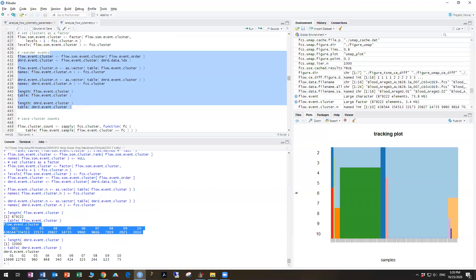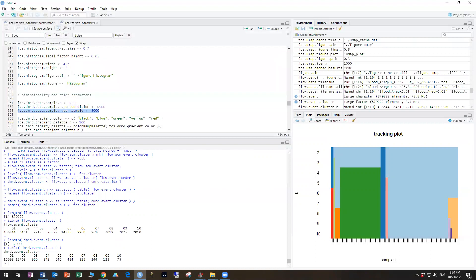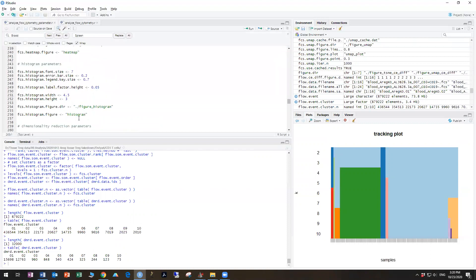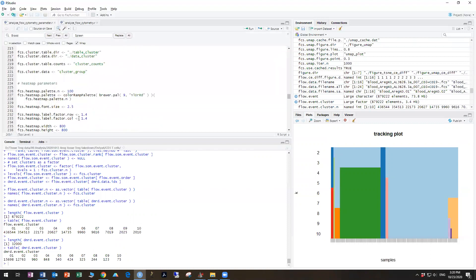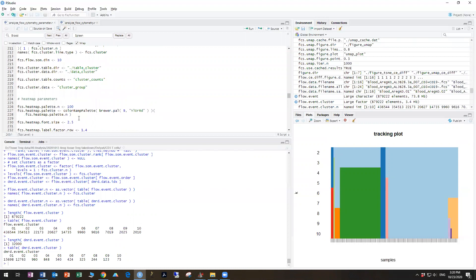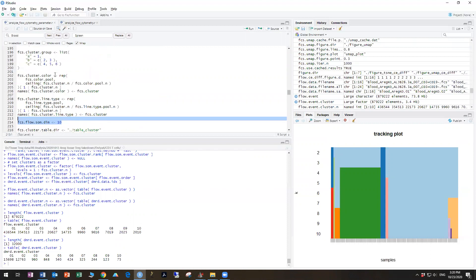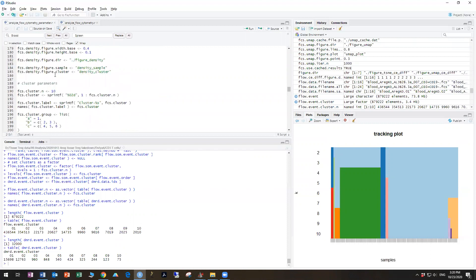So this is telling us about the structure of the clusters that we generate. The first cluster is always going to be the biggest, and so on down the line. You can change the number of clusters that you want in the parameter file, which is here, FlowSOM dimensions, 10, and FCS clusters, 10.